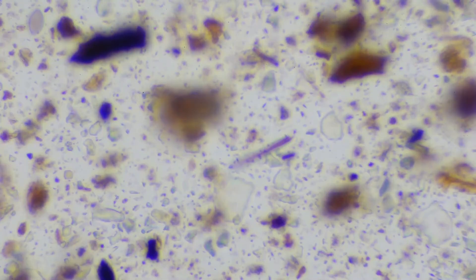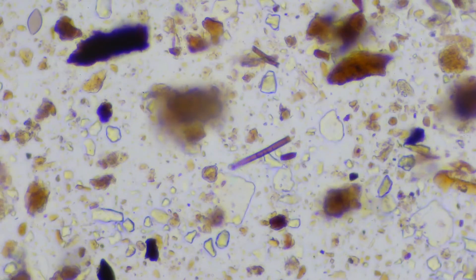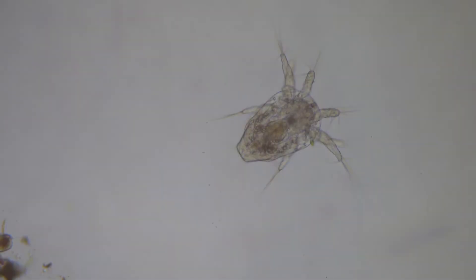We can see one little fungal hyphae there in the middle, but a lot of clear things, a couple of aggregates — it still needs a lot of work. The funnest part is you never know what you might find in the soil; for instance, this guy is an arthropod.